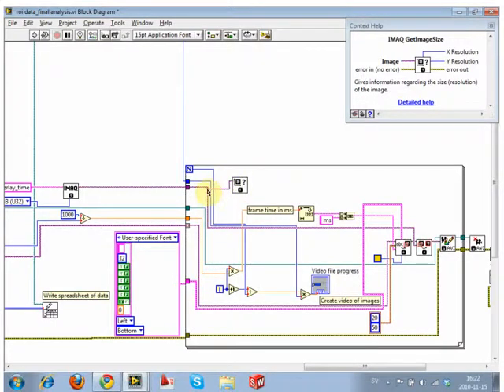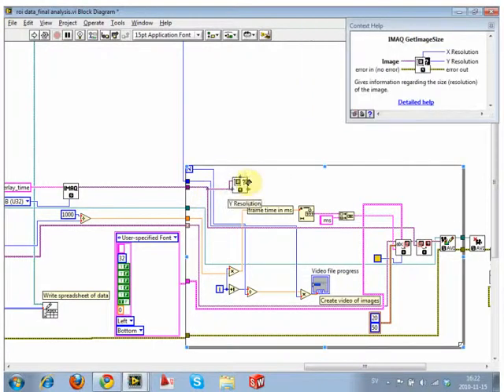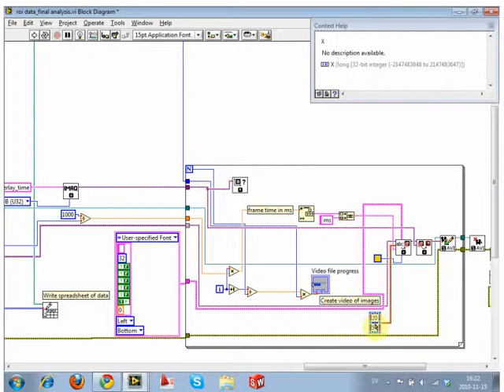And then using prior information, you can decide how big an offset to make the origin. So the origin in LabVIEW is always top left. Okay, so 0, 0 is at the top left of your image, and then it's X and Y. So it's like how many go over, how many go down, and that's where it starts to write. If you're really good at coupling these things together, then you can set it as some kind of ratio based on the image size.